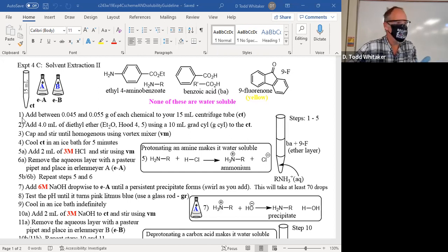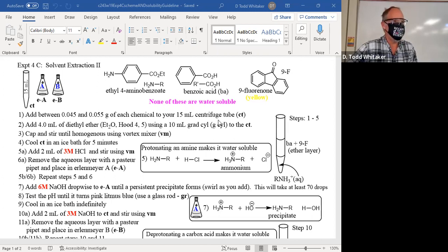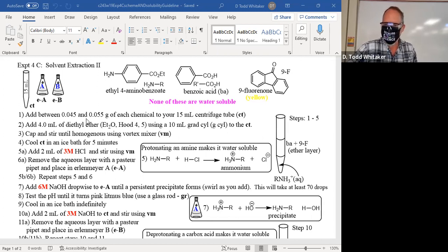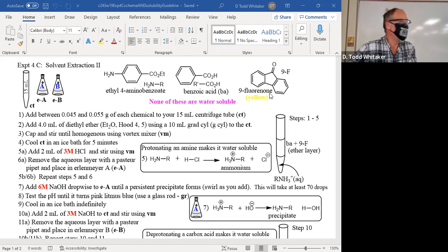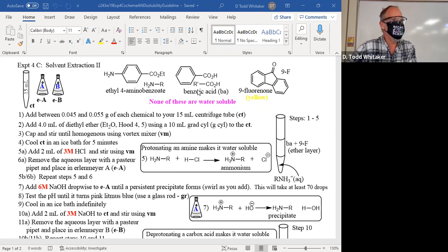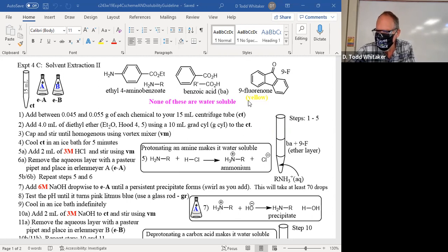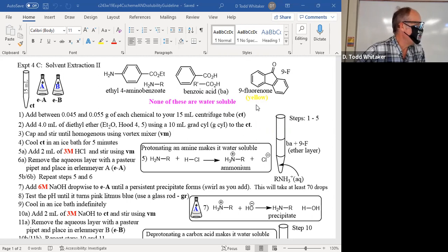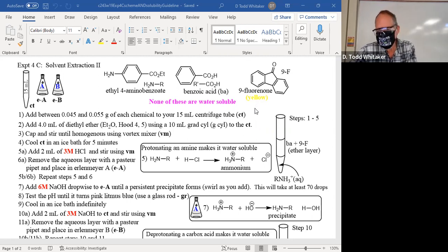I will do number one for you verbally. To a 15-mL centrifuge tube was added 0.047 grams of ethyl-4-amino-benzoate and 0.052 grams of benzoic acid and 0.049 grams of 9-fluorenone. That's the one that has the yellow color. Everybody's done that already — we've all been milling around getting ready.